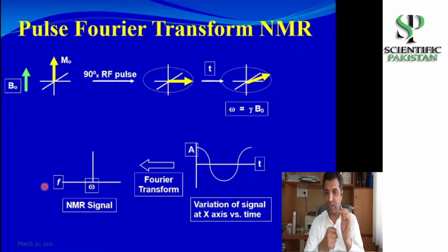And so it diminishes to a very small extent and it lowers the Larmor frequency by a few hertz. So the difference of frequency between all of these different types of protons in a molecule is not in megahertz, but it's in hertz, because the difference of the induced magnetic field between these is not a great deal. And so it varies the Larmor frequencies of these protons by a few hertz.